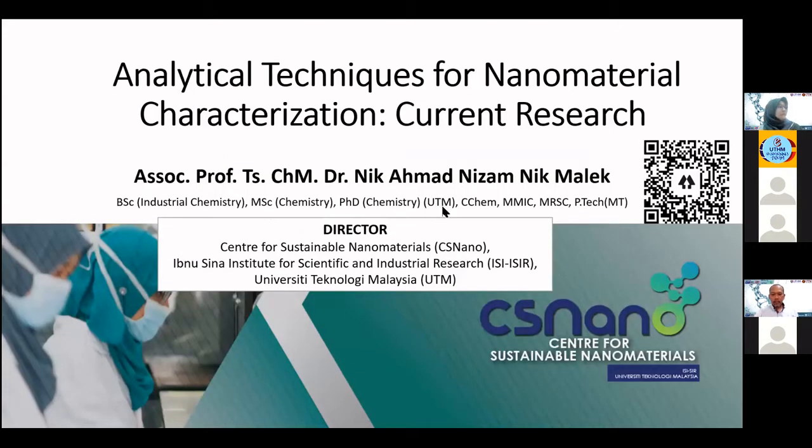So this is the title: analytical techniques for nanomaterials characterization. I will give a talk on the characterization of nanomaterials, and some of it comes from my current research or from my previous research.